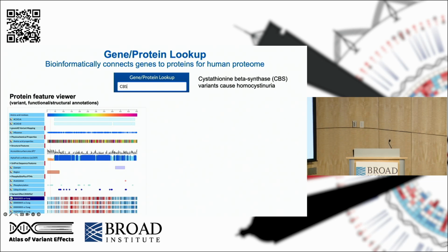You could see going from about residue 100 to about residue 400, there is a loss of function in the MAVE screen. And then we add additional annotations to the sequence. Here we added physicochemical properties, UniProt annotations, and post-translational modifications. And from the PTMs at the bottom, we could see that the ubiquitination sites seem to line up. So there's a potential correlation there.